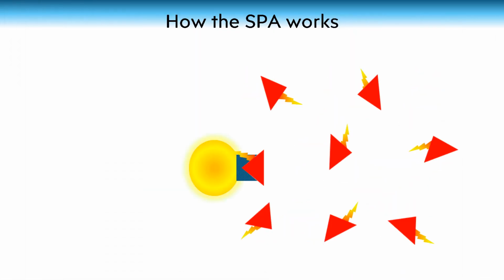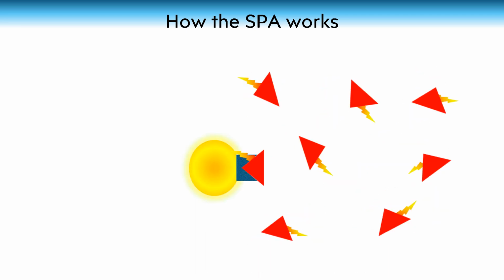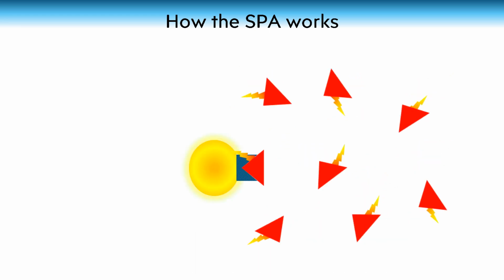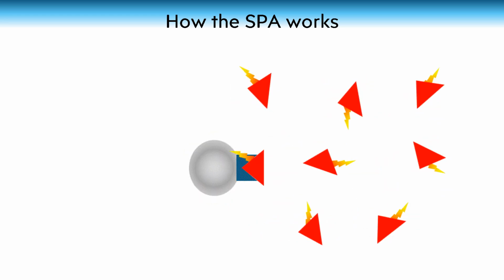This cartoon illustrates what happens when the SPA beads containing the target protein are mixed with the radioligand in solution. The beta particles emitted from the radioligand in the bulk of the solution are dissipated without activating the scintillant in the bead, because they are too far away.